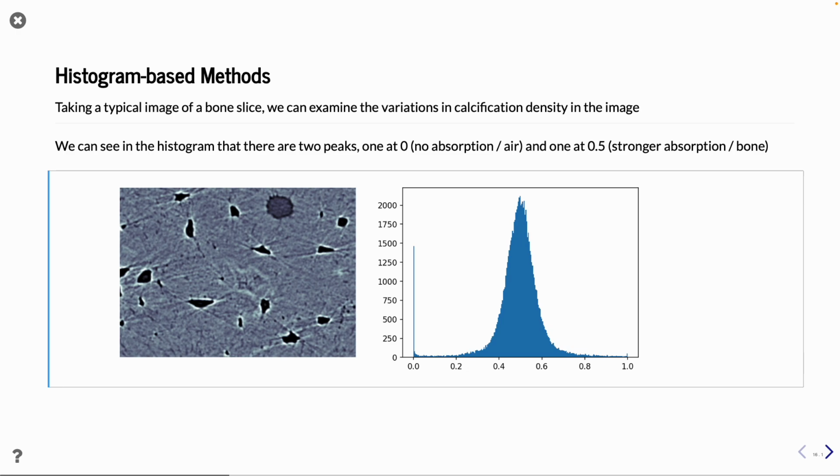Starting out with the histogram based, looking again at these bone cells, the histogram is not really convincing to do segmentation on. We have the big gray mass, the background, which gives us a large peak. But then it's very hard to say where to put the threshold to get these large areas. Probably we should put it somewhere in this range, but it's not really clear where.